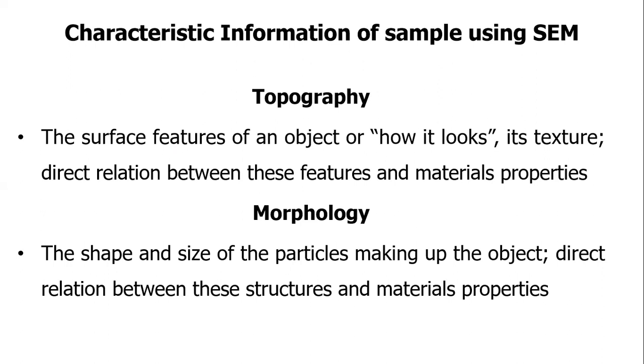Morphology: the shape and size of particles making up the object, and the direct relation between this structure and material properties.